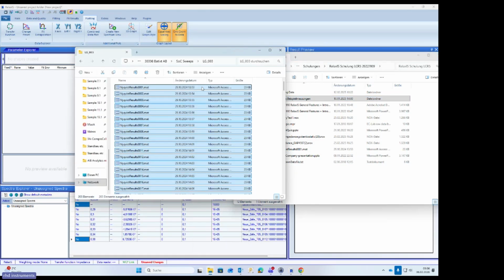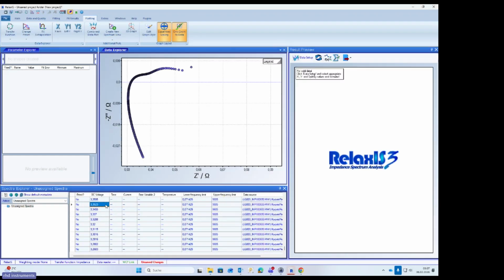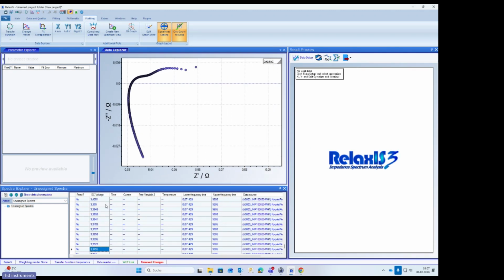this. It will take a little bit longer now. This very large package of different data sets is battery data that has been recorded using a special cycler. Let's see, it should be there in a few seconds. Now it's there. You see we now have multiple data files loaded in the software.